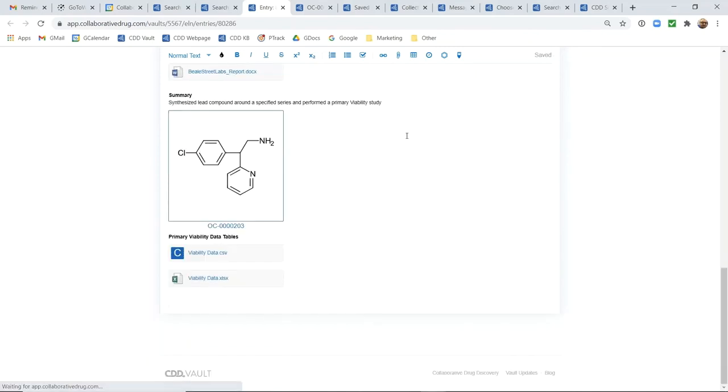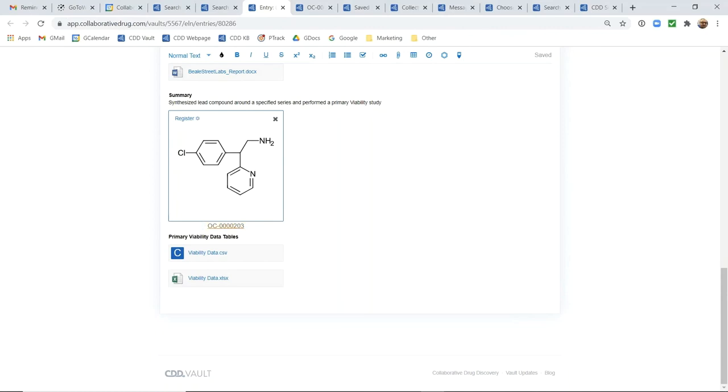Scrolling down, we also can insert just chemical structures so they don't have to be reactions and again if I hover over this chemical structure you can see the opportunity to register this in my registration system but I can also see here that this compound already exists in my CDD vault registration system with an ID of OC203.